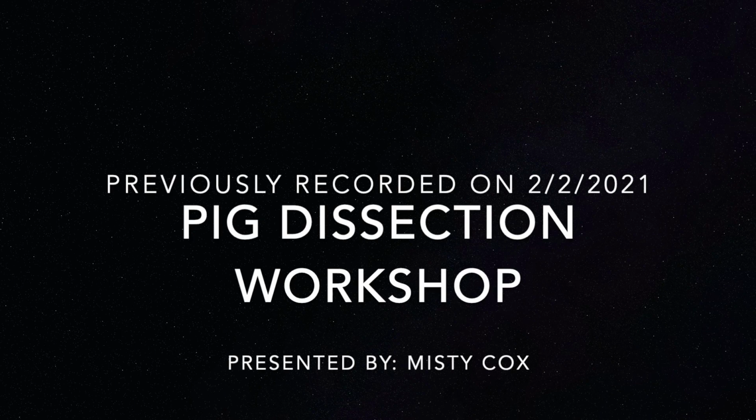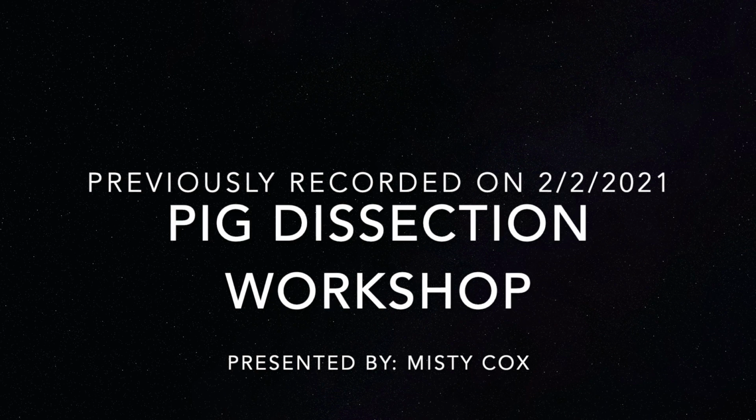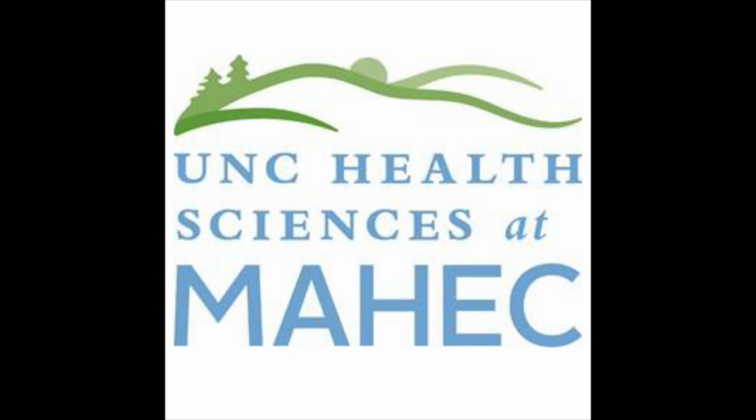Do a virtual pig dissection. And if you have any questions while we're doing the virtual pig dissection, please feel free to unmute yourself and stop me, or you can put your questions in the chat and I'll be looking at that as well.